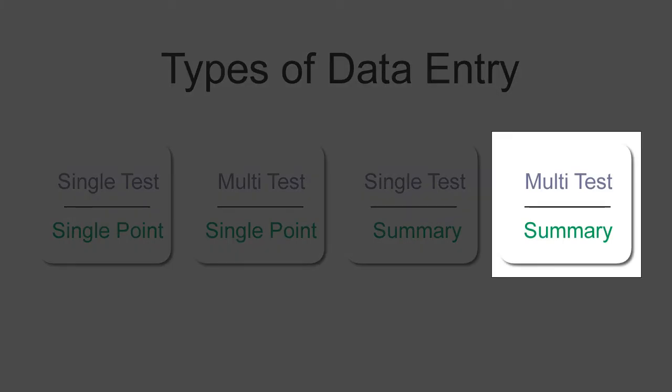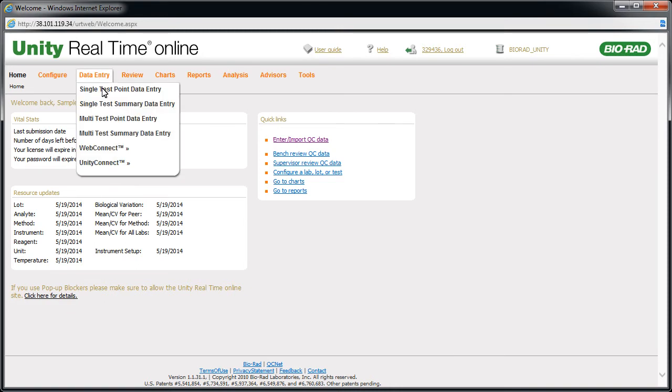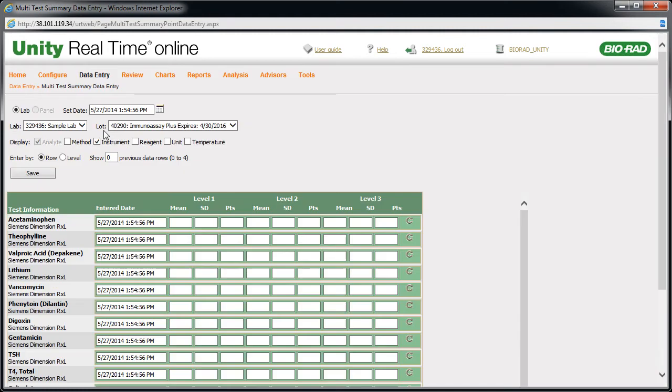let's take a look at entering summary data for multiple tests by returning to the screen where we left off. Point to data entry and click Multi Test Summary Data Entry. The layout is similar to the last multi-test approach.